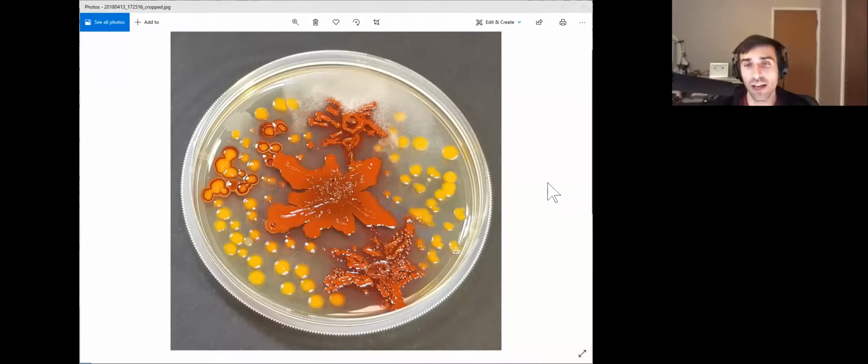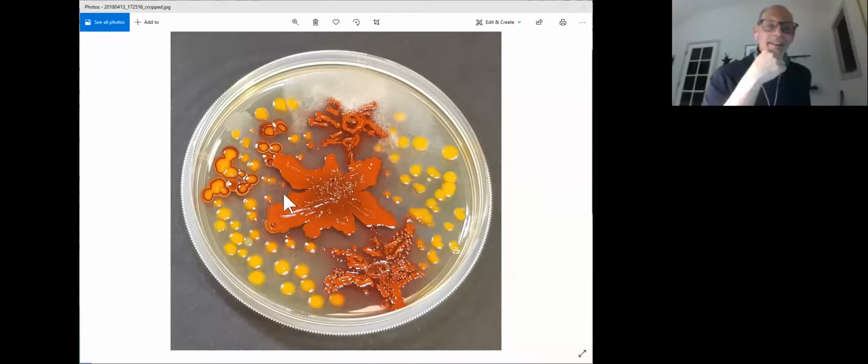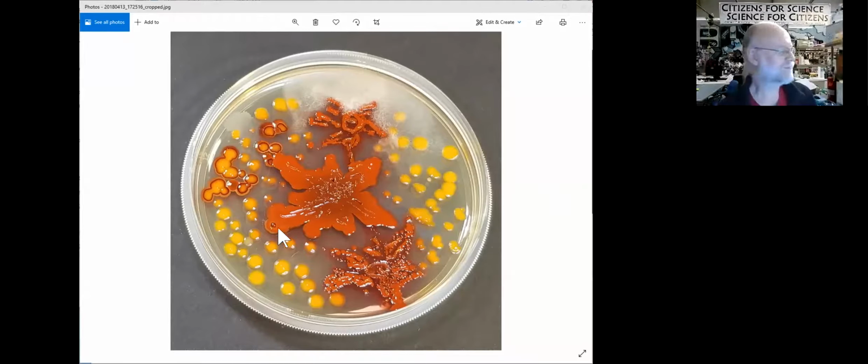Yeah. Here's a nice example of some of the weird interactions you can get with naturally pigmented strains. You see that one strain is actually just growing along the outside of the other strain here. Yeah, I like that. That looks cool. How did that happen? It's just Serratia marcescens does weird things.